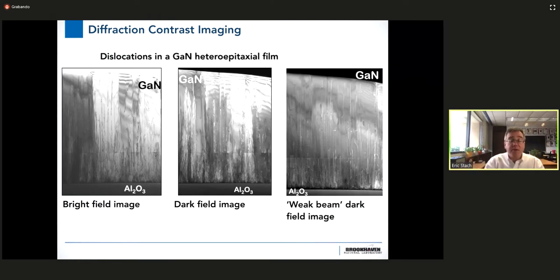It's so important that its discovery in 1995 led to a Nobel Prize for Shuji Nakamura and colleagues. So, an important crystal. These are some older images that I took back when people were really understanding these sorts of things, and I was working on it a lot.